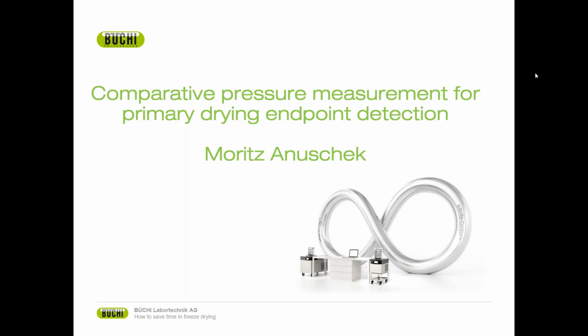Okay, thank you very much for that answer. So that means that you can use a Buchi rotary evaporator to freeze those flasks rotationally. Yes, you can use the rotor evaporator you have in your lab anyway. Just swap out the normal water bath, the heating bath, with a Dewar.